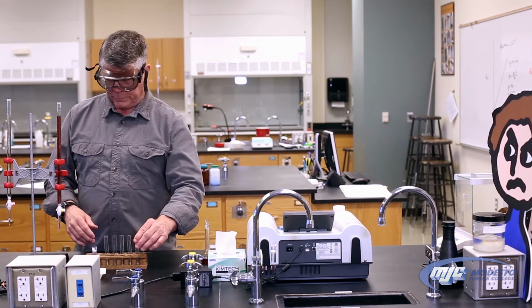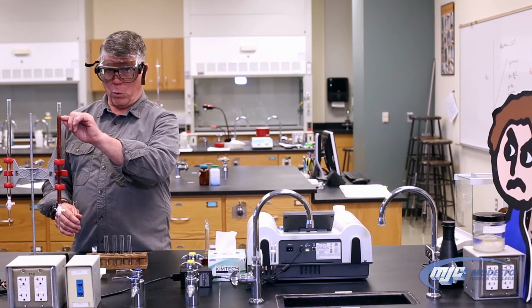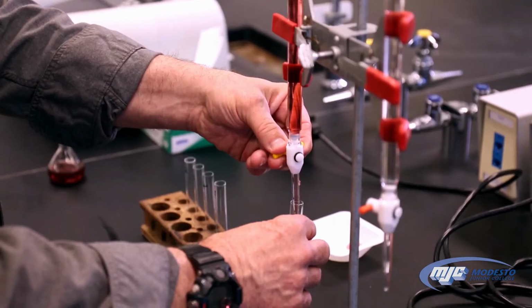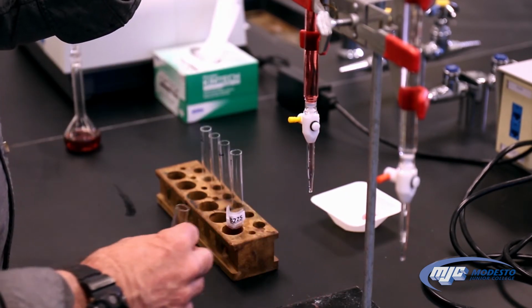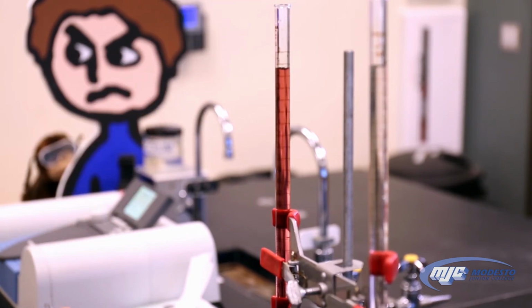So again, it doesn't have to be exactly 1 milliliter. What we do is we read the initial volume, record it in our data table, figure out where 1 past that is, add 1 to that number. Open up the stopcock till we get to about that place, close it. Doesn't have to be exact. Read the new volume, the final volume, 2 places past the decimal, record that in our data table.